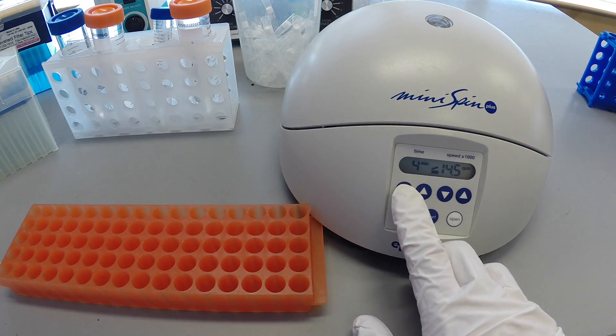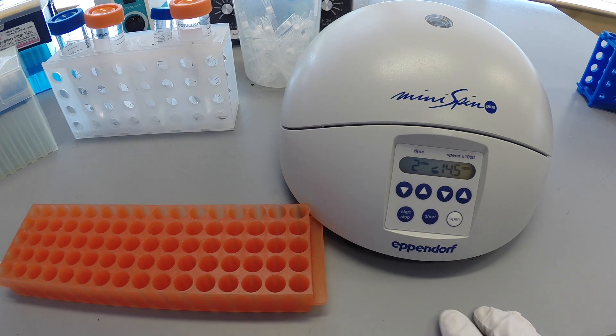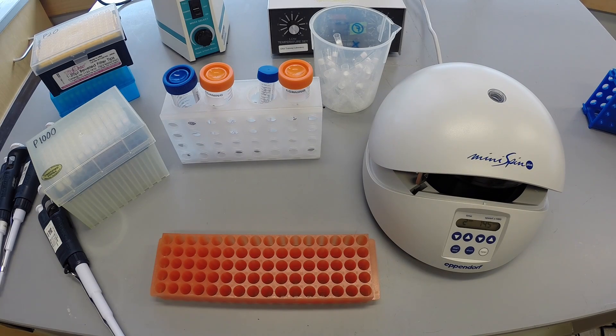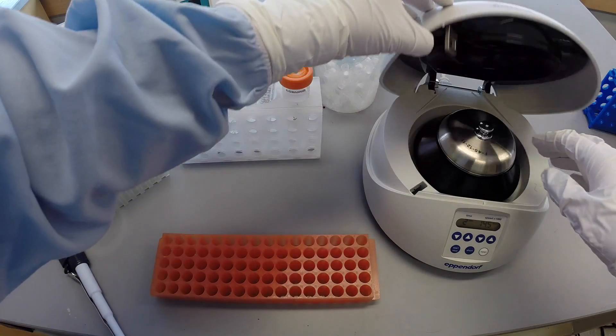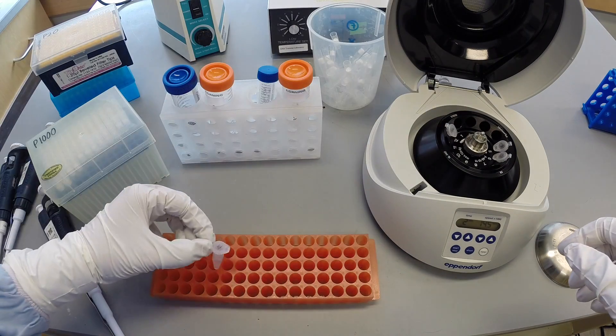Spin the samples for 2 minutes. Remove the tubes from the centrifuge gently, being mindful not to disturb the pellet which now contains your DNA.